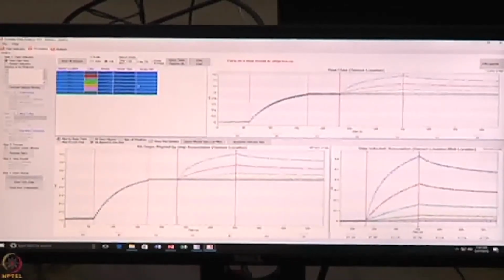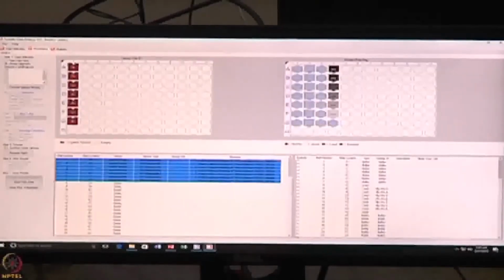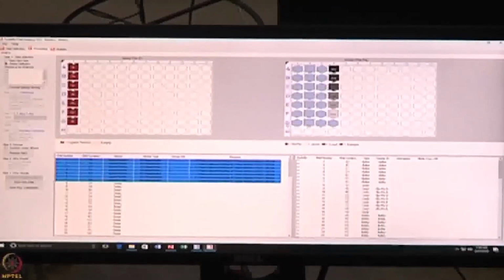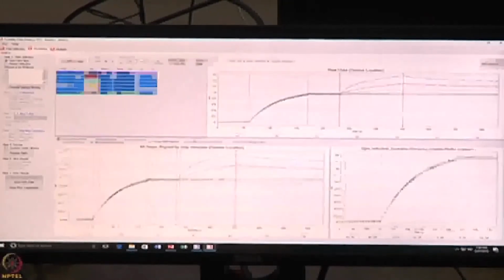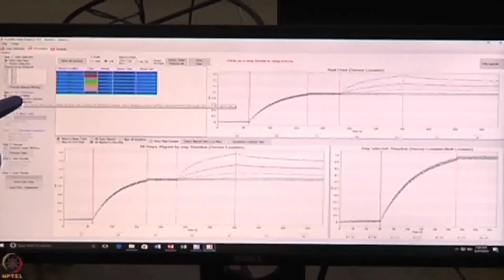Okay. So here in the top section, sensor selection, what I have to do is the subtraction. I had put a 0 concentration here. What I will do is select this, right click it, change well type to a reference well. Okay, then I enable it. Now I will go for the subtraction here. In the subtraction I will use a reference wells.